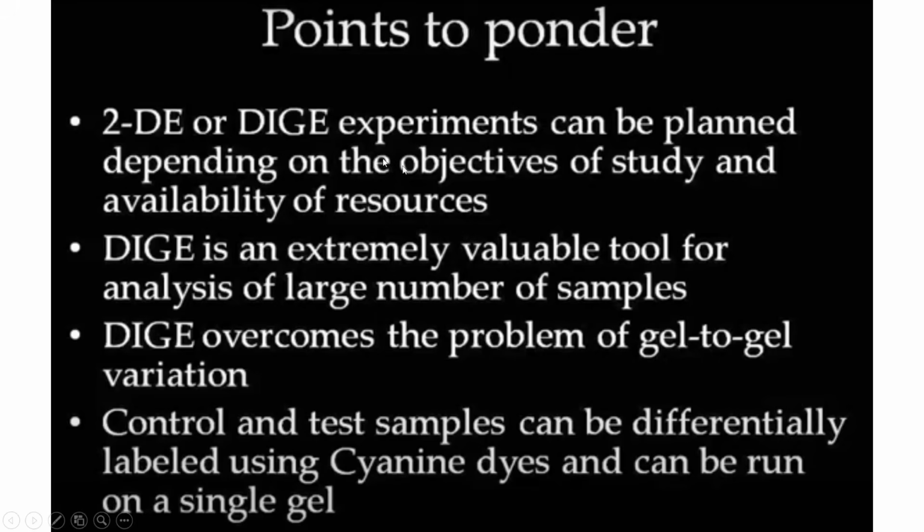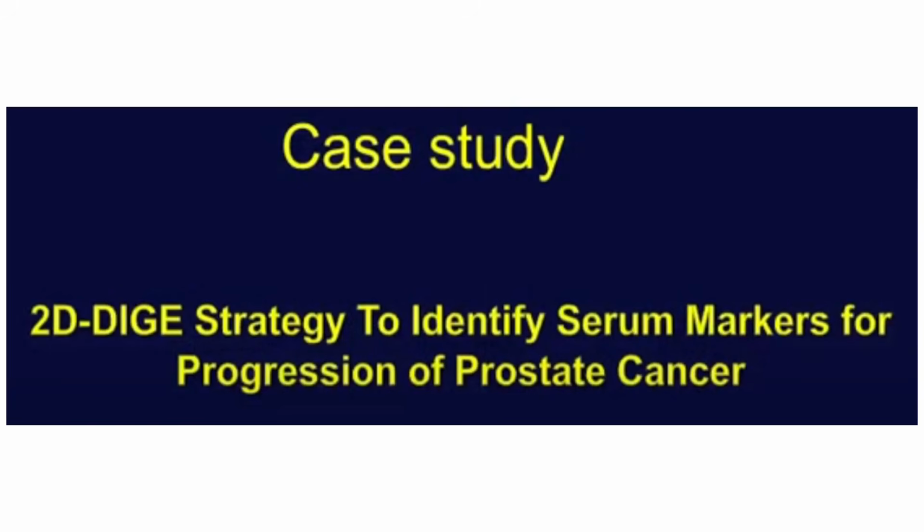So basically, depending upon your objective, both of these techniques can be used, and it is an extremely valuable tool that overcomes gel to gel variations. With cyanine dyes, it can be run on a single gel itself, and you can check the differential expression in one gel, minimizing the load while doing the analysis.